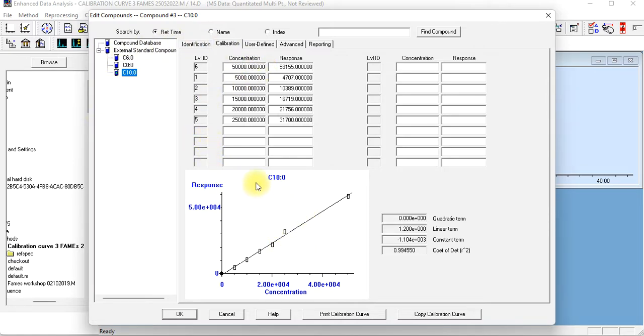Okay, have we completed up to this part? So this is a calibration curve, but you have to take note, the calibration here only covers 6 points. But for those dealing with method validation and verification, the calibration curve shall contain at least 7 points including blank. So in the case that we run the GCMS, try to run one simple blank, make it another level. So usually blank will get 0 point, so it will plot another 0 here. So you will get 7 points of calibration curve including blank, meaning one blank and another 6 concentrations.